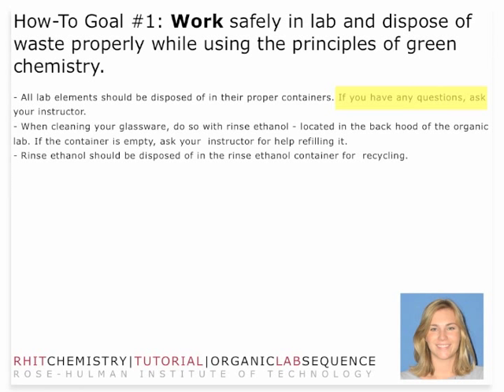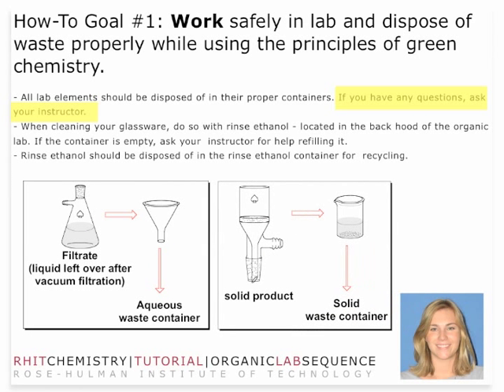If you have any questions about specific disposal of materials, make sure you ask your instructor. Today you're going to have two types of waste: a filtrate and a solid product. The filtrate should go into the flammable waste container. You'll have some ethanol present in your filtrate, so you do need to dispose of it properly in the flammable waste container. Your solid product should go in the solid waste container. Remember to make sure you have all of the data before you throw away any solid material — I recommend keeping the solid for an additional week just to make sure you don't need it for further measurement.